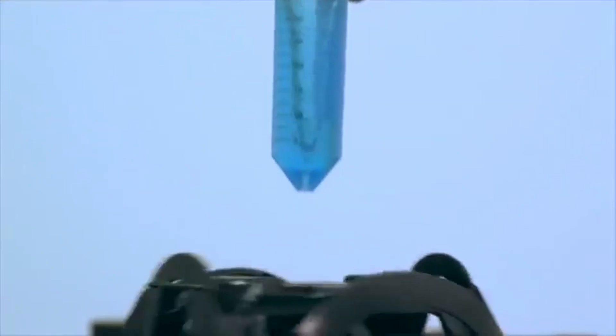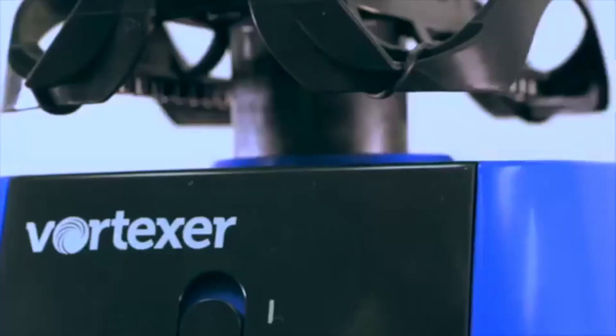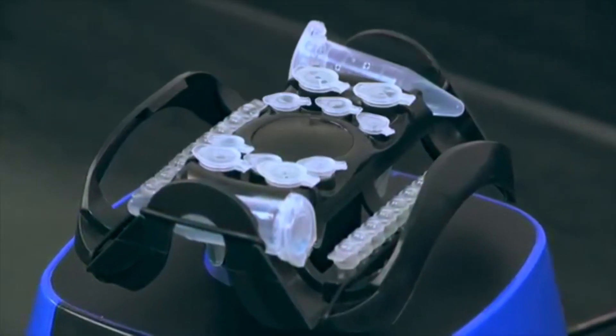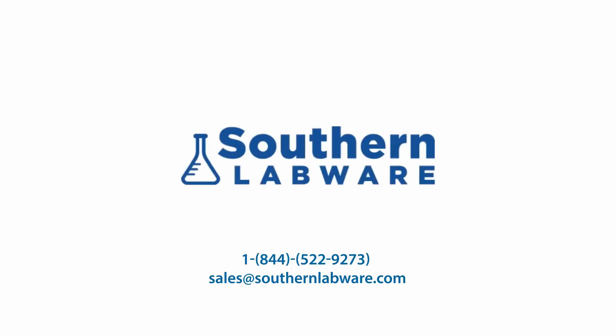This functionally designed mixing head increases productivity and reduces costs as well. There's no need to purchase another mixer — the Vortexer does it all. The flexibility of this unit saves time in the lab by responding to your needs with great versatility. Get yours today.